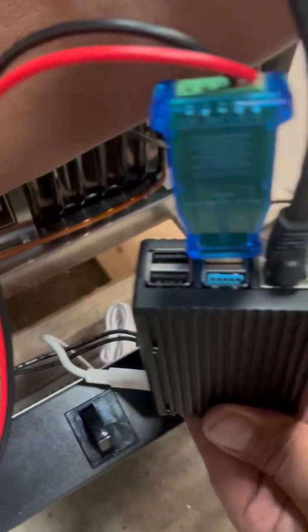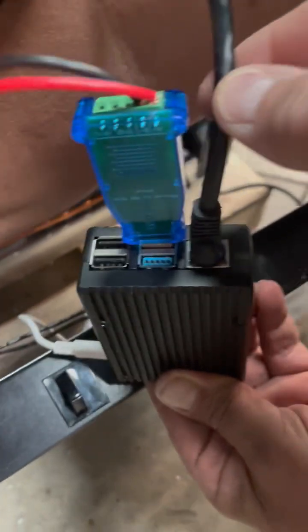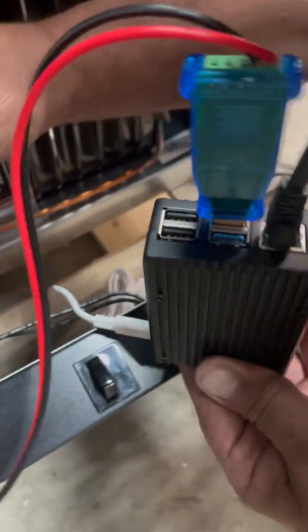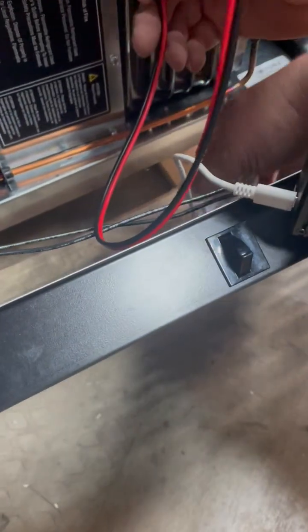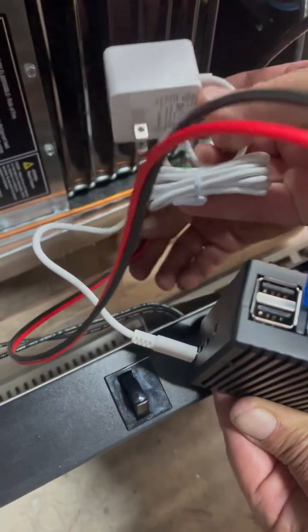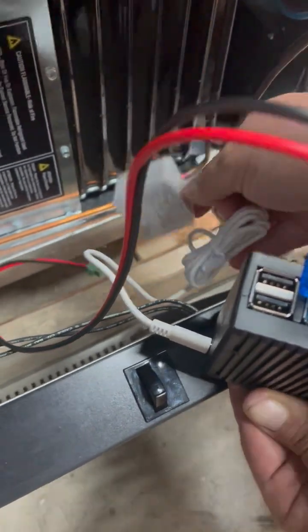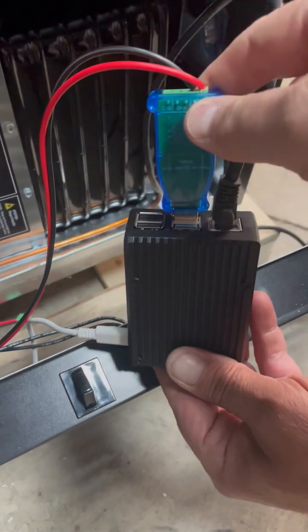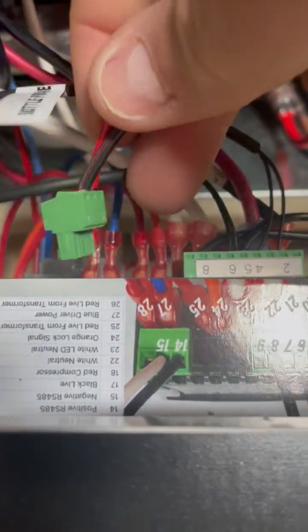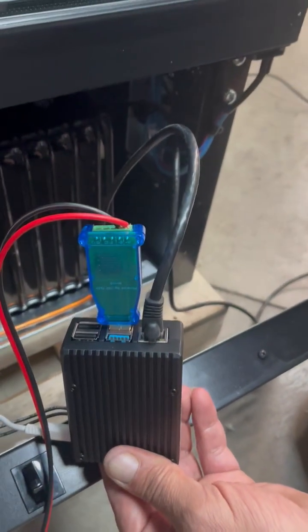Then you take your internet connection and run it through the bottom of the machine, out the back, along with your power cord for the Raspberry Pi, and plug those two in on the back side. So again: Raspberry Pi, this is the adapter we're sending, with the cable that then gets connected right here.